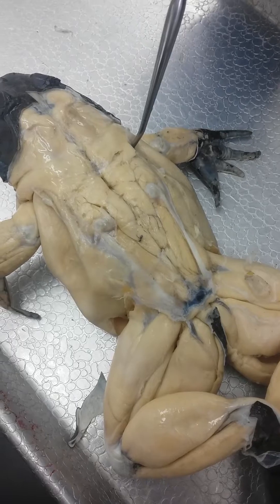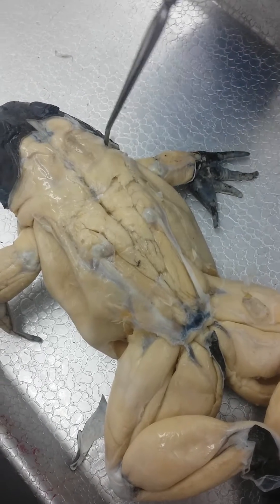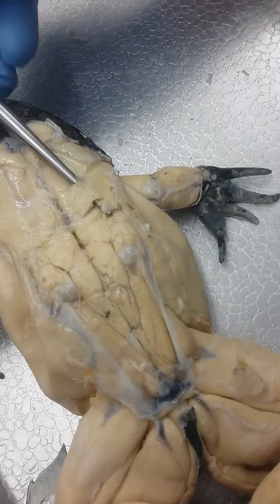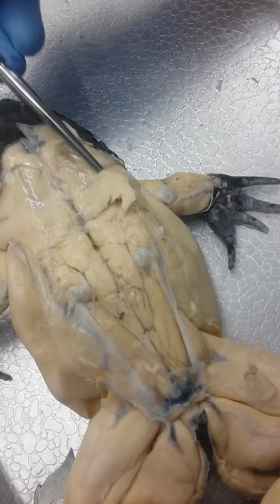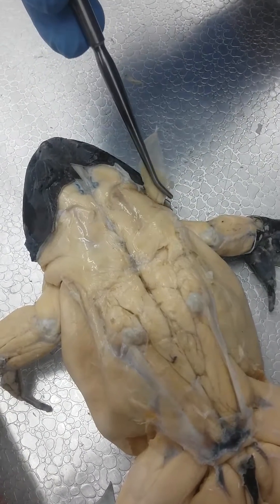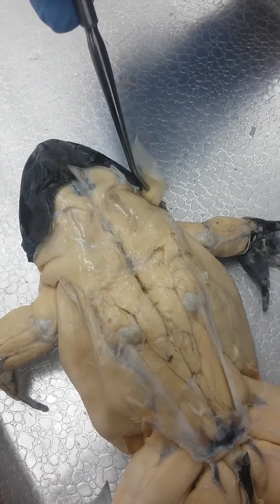It leads all the way up to this right here — this is latissimus dorsi. And then right on top, right above that, anterior to that, we have dorsalis scapulae.